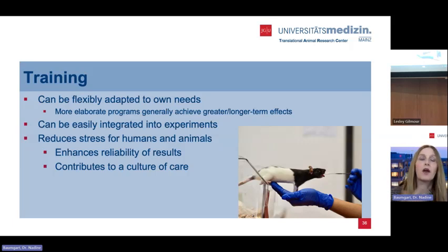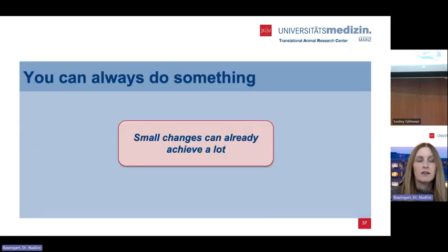And if we have less stress, it can enhance the reliability of our results. So we don't measure stress artifacts. And in general, this can contribute to a culture of care we talked a lot about in the recent years. And with this, I want to say that you can always do something, and also very small things can have a good and helpful impact.